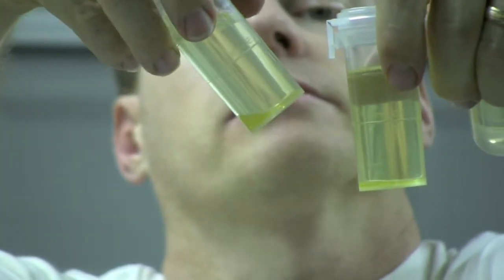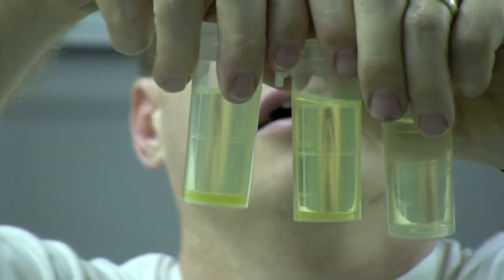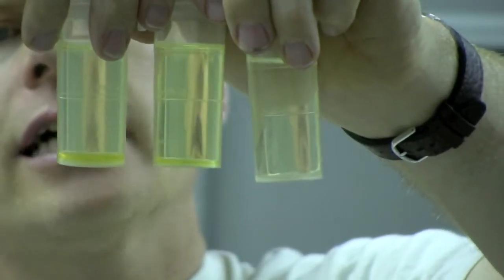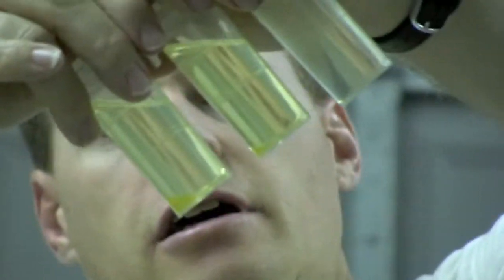This batch was not quite there, and this batch really wasn't there. Just by the color that these exhibited — and this is the same exact oil, by the way — color normally is not an indicator, but where you've got the same exact oil it can be. You'll notice we have just a ton of fallout in this one here. So again, the reason that we do a titration is so that we get a successful reaction, which the 327 test allows us to find out.